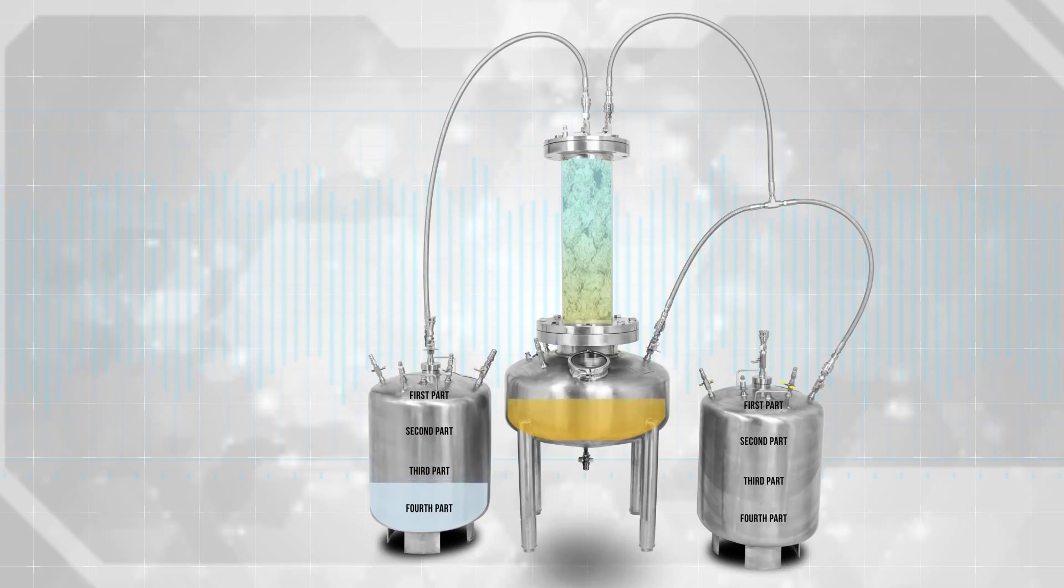Using an adequate amount of solvent to perform a complete extraction allows you to send the appropriate amount of solvent through the plant material in one pass as fast as you want at any temperature with any combination of solvents. Recovering to loop it back through in the middle of an extraction process disables these controls.